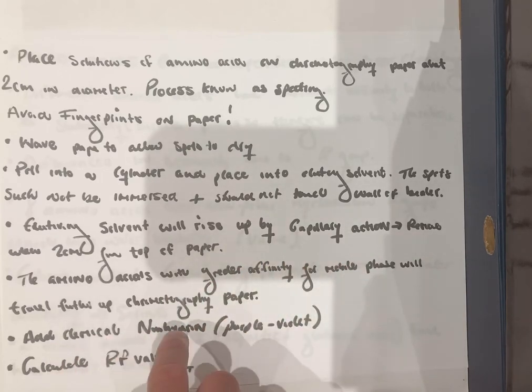What you have to do is add a chemical called ninhydrin, which stains the amino acids with a purple-violet color. However, this is very dangerous and safety precautions should be taken when handling this chemical. Once the amino acids are now visible as a purple-violet compound, you can calculate the retardation factor.